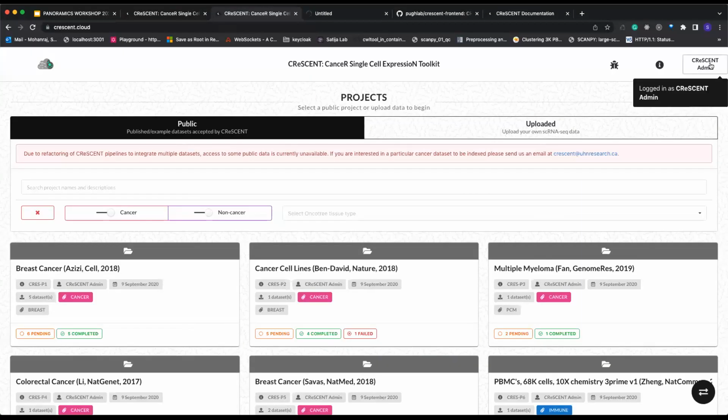The last thing here on the menu is your user. When you're logged in, what you'll see is, actually, that's not going to show, but what you'll see is public user. And what are the constraints of a public user? Well, it's stored based on your cookie. So the second your browser refreshes your cookie for some reason, you're going to lose all that stuff you put there. So what I would recommend is to register. You just put in an email and a password, and then you have access to your account at all times. It just makes sure that the data is safe. If you are a public user and you've uploaded some data and done some analysis, it's really hard to find that public user because it's just a random ID. So it's better to create an account.